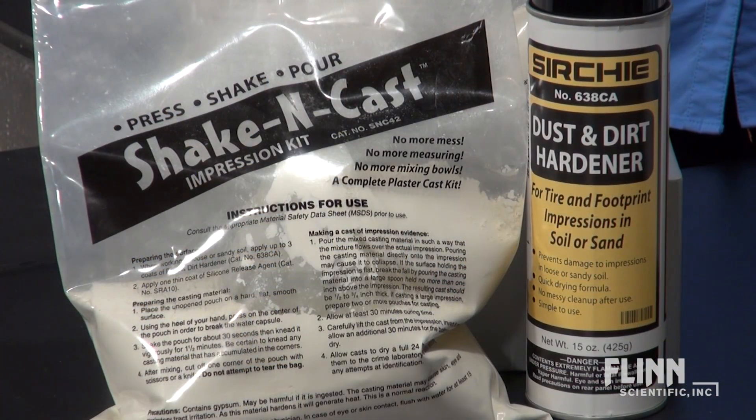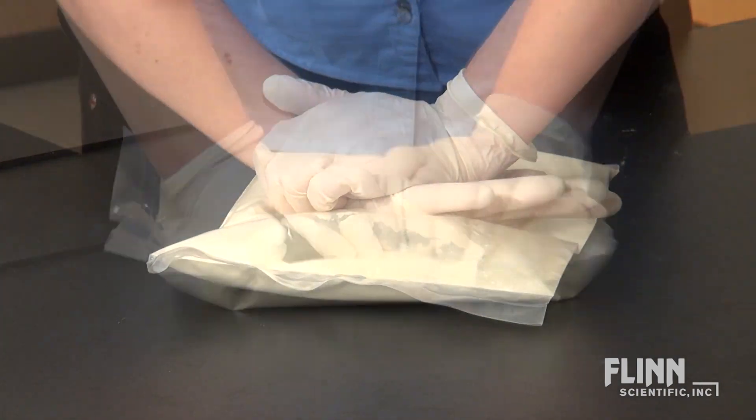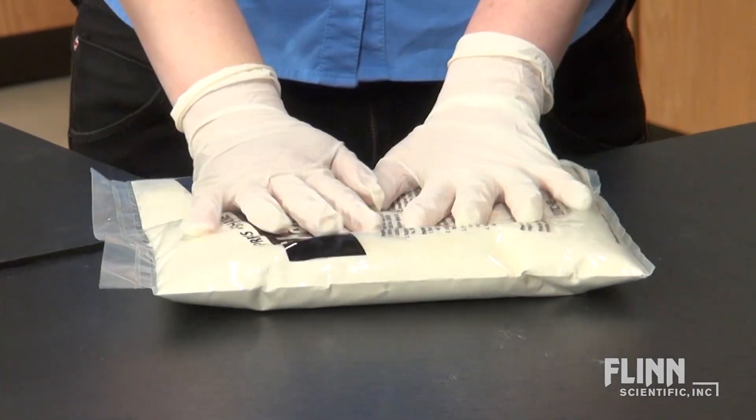When a footwear impression is found at a crime scene, the details can be preserved using a shake and cast impression kit. Simply break the pre-measured water pouch, thoroughly mix the ingredients, and then pour the mixture into the impression.